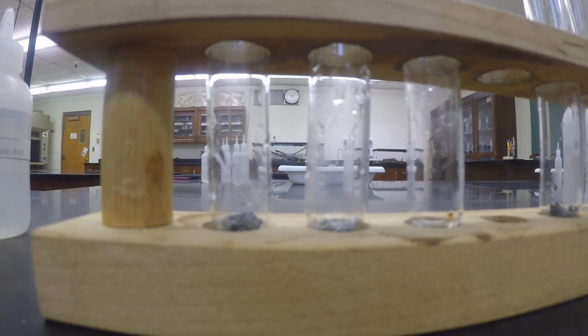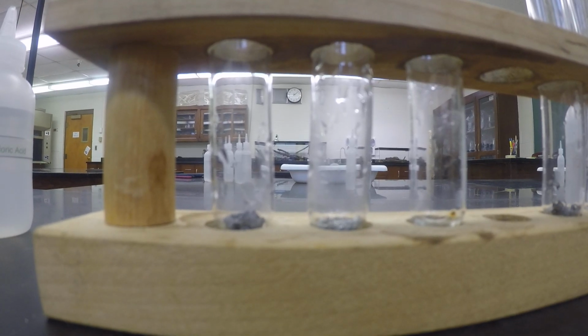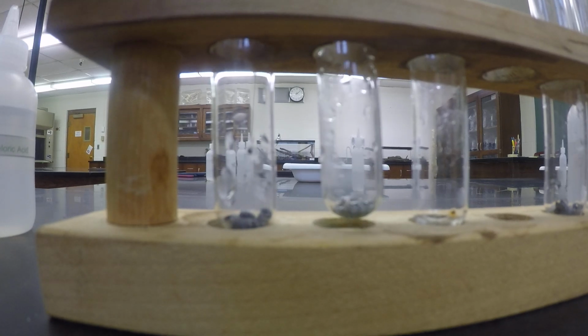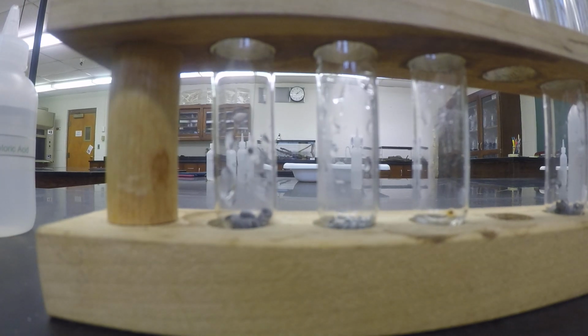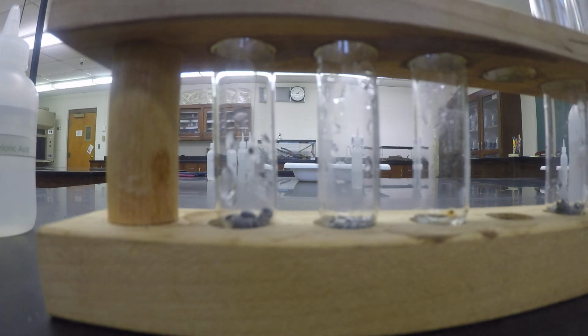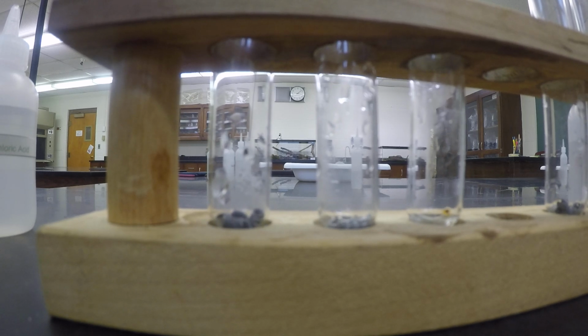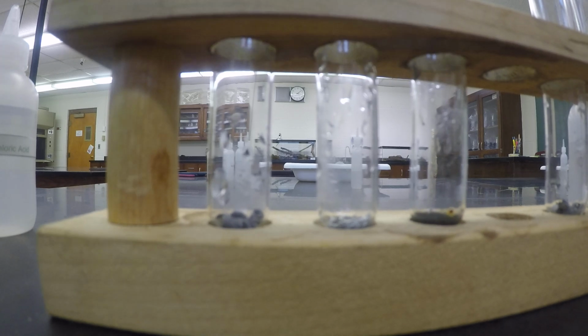In the first test tube, I have magnesium. This has some zinc in it, and I'm going to add some iron to this last test tube. You don't want to add a whole lot of iron because it makes it hard to see what's going on in the test tube. I'm just going to add a little bit.